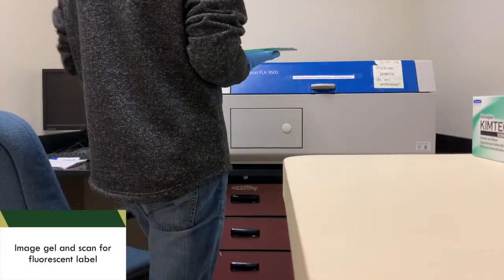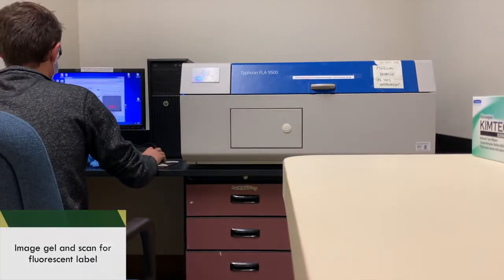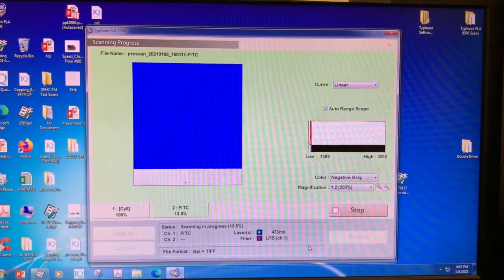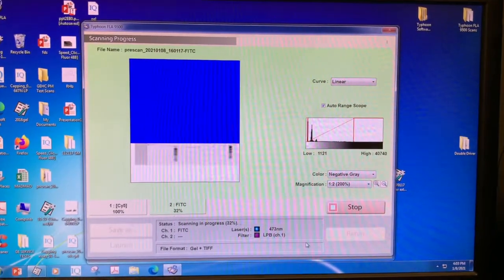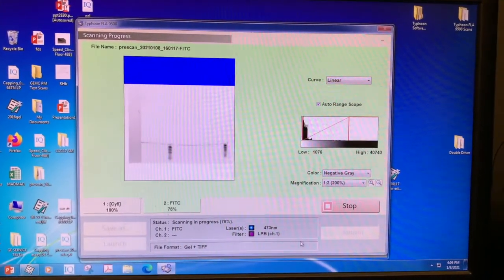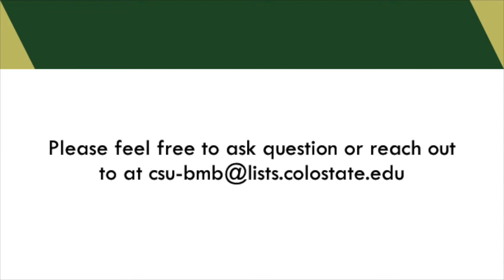Right here we have a Typhoon that we are going to work with, and it's going to scan our gel and tell us exactly where our bands are. So we do a pre-scan first, and that's so that we can target where we want to look and get really precise measurements. And then once that's done, you can take those results and import them into ImageJ and get peak integrations. And that wraps up running through a nuclease assay and taking it through a denaturing gel.